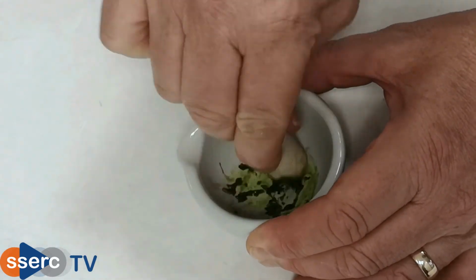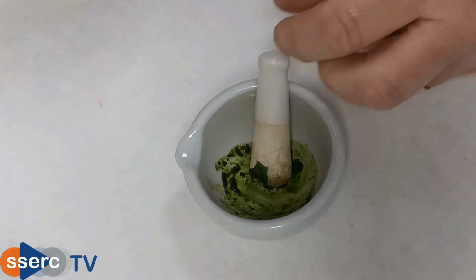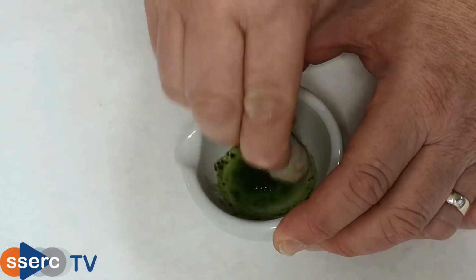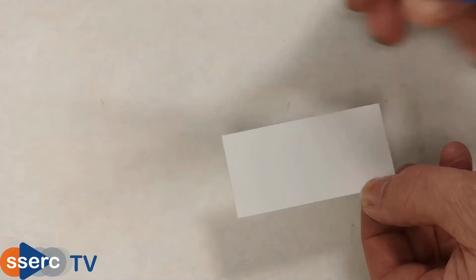Tear or cut a couple of leaves into pieces and put into a mortar. Then grind with the pestle. Once you're happy, add a small amount of propanone, a milliliter or two is fine, and grind some more. You may need to add a little more propanone, but you want to make sure you have the minimum amount that actually still has some liquid in it.